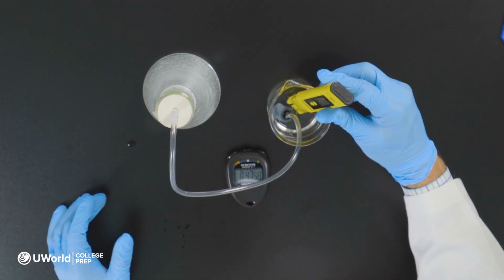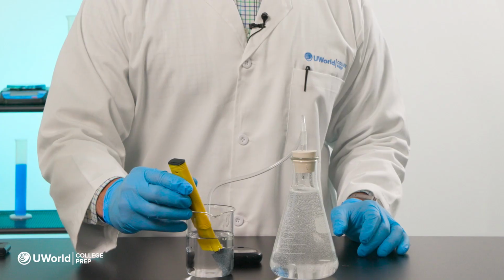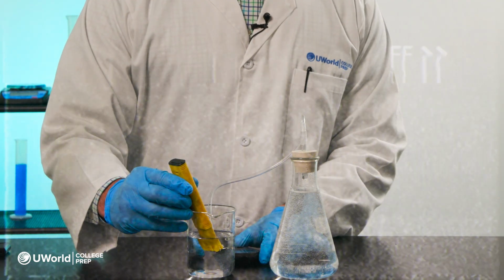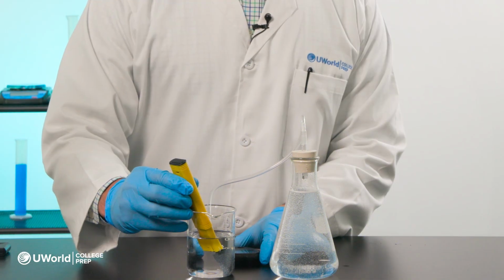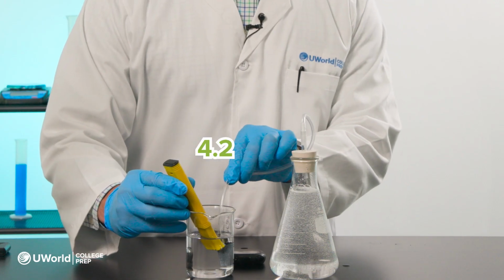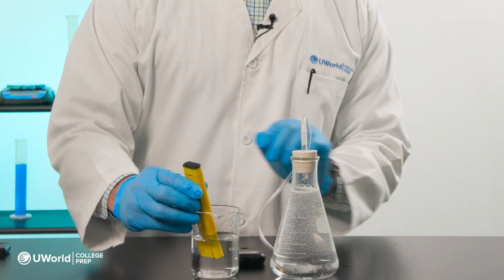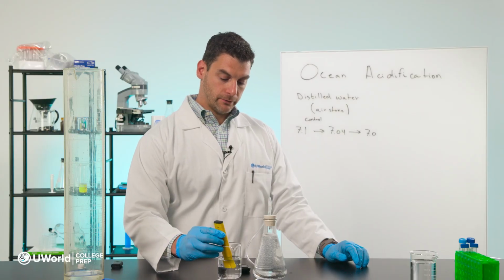So now the bubbles have died down quite a bit, but there's still some happening. Our pH is continuing to drop. And so about rounding off our minute here, the pH is 4.2. Now we're going to take our air stone out and continue measuring the pH for another minute or so.